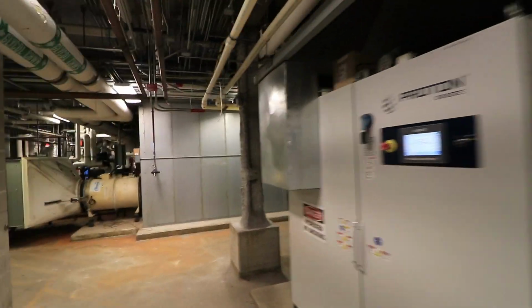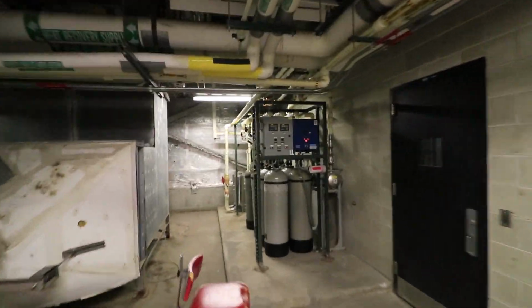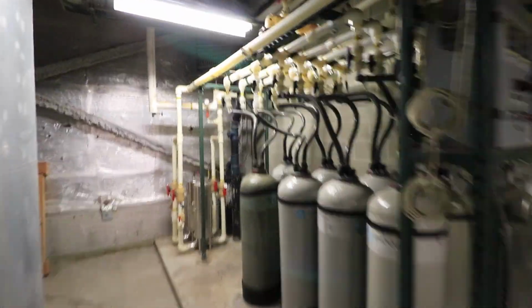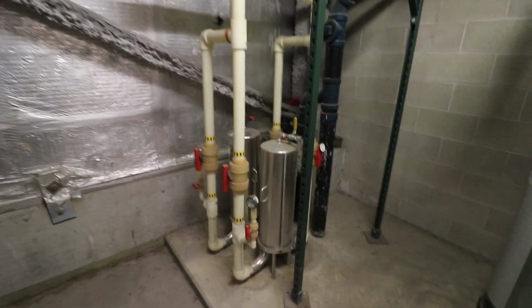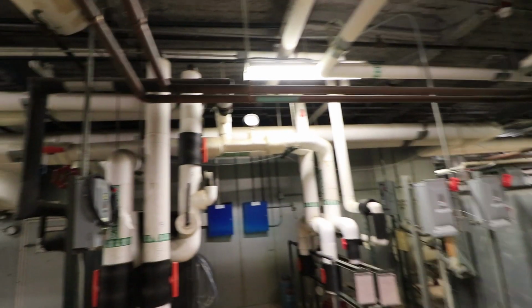There's also a high-purity deionized water system. High-purity deionized water is provided to all the wet benches at a resistance of greater than 17 megaohms and a particle size of less than 250 nanometers. The cleanroom also has a dedicated process chilled water loop that's isolated from the rest of the building supply that's used to cool all of the internal components that require cooling within the cleanroom.